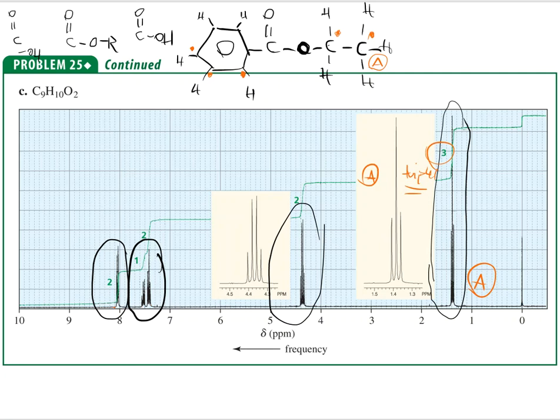And then the integration number actually perfectly matches the number of hydrogens that we're getting here. Again, those calculations are already taken care of. We've talked about the integration calculation a little bit earlier, but here they're kind of already taken care of for me. All right, so that, pretty good.